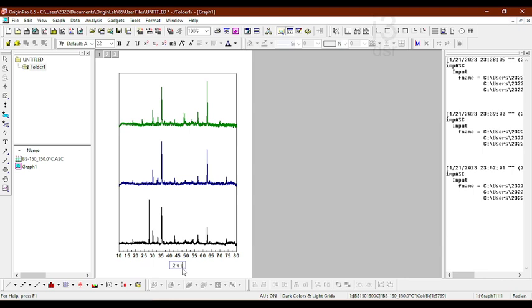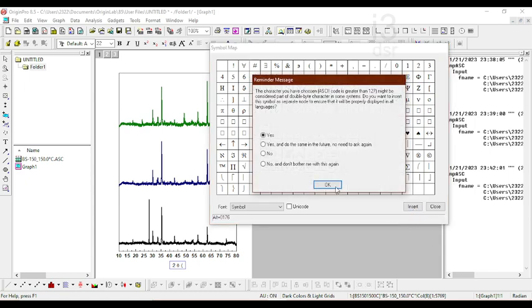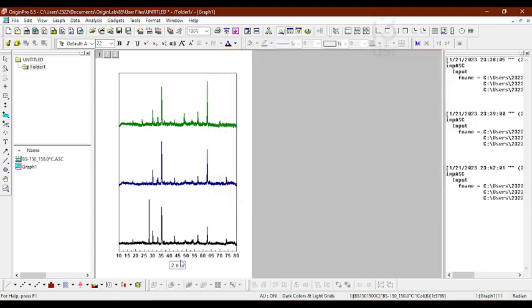This is in degree. So I'm going to press Control M. This is the shortcut, and this is the degree symbol. I'm going to insert it, close bracket, 2 theta in degree. For this also I have to increase the font, maybe like 26, and double click on this, select all. You can make it bold, so it is a little bolder if you wish to increase the size. Then also select all, 20 for better visibility. We have this data now.